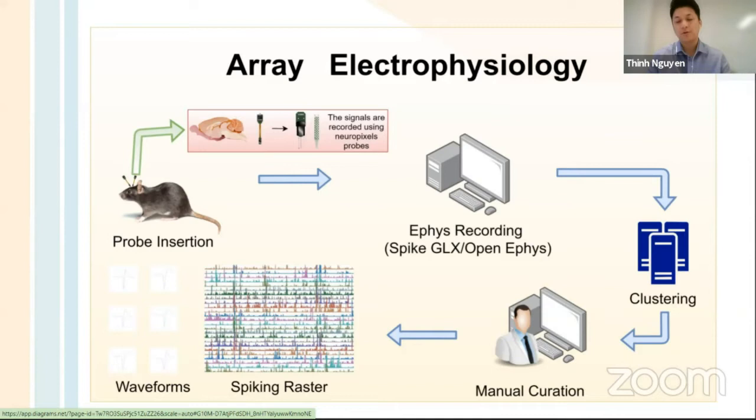So a typical step for this type of experiment is to run some sort of analysis that would help you extract neurons and their individual activity from this mass, superimposed set of data that you collected. Essentially it is similar to a blind source separation type of problem, right? There are a number of different packages that do this kind of spike sorting. One that we support in this workflow is Kilosort. Kilosort is a quite popular package for spike sorting, and they've done a number of optimizations for the Neuropixels probes.